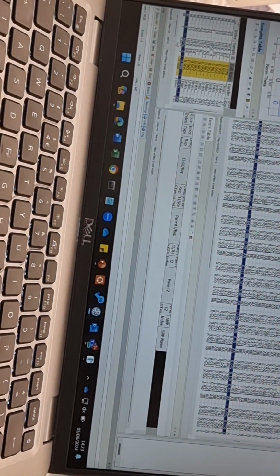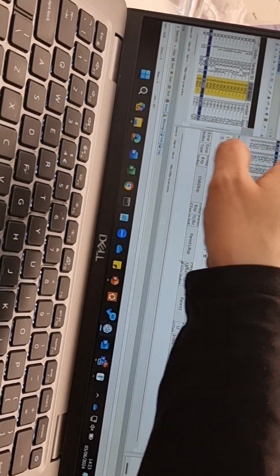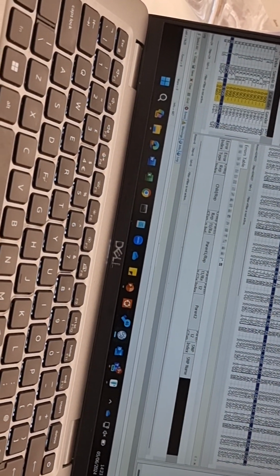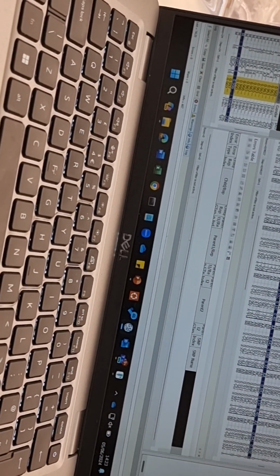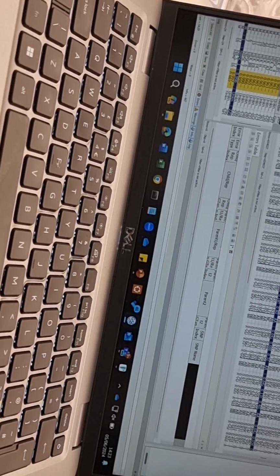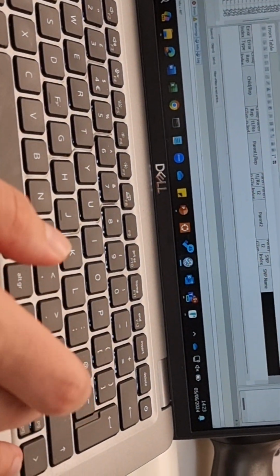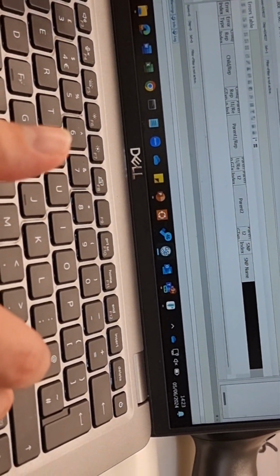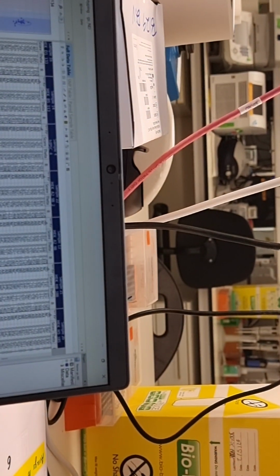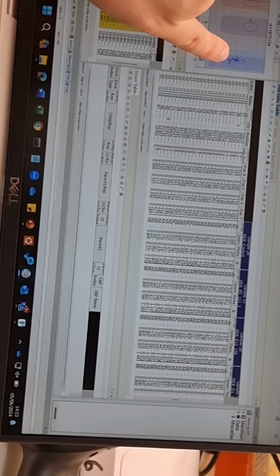So there are two different cell lines, this is the iPS line, and this is the cancer cell line. It might be because of the lines, but it doesn't look too bad. Some of them didn't look full. It's these ones here. These are the individual SNPs, not the patients or the cell lines. So the individual SNPs haven't clustered fantastically because there's some on the outside. That's probably because of the edits.